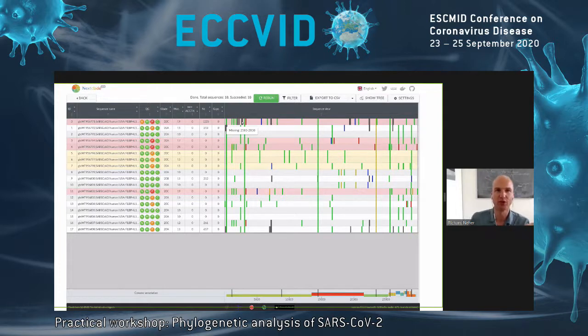And this is one of the first things that Nextclade will show you here. Yes, you have mutations, but you also have chunks of your sequence that are actually missing, right? And this is one of the sequence quality metrics that Nextclade is providing you. So Nextclade is, for one, annotating your sequences with a clade. So these all end up being 20A, C, or B clades. That's why they all share these mutations. But it also provides you with QC metrics, so quality control metrics, that give you some sense of how good or how reliable your sequence looks.